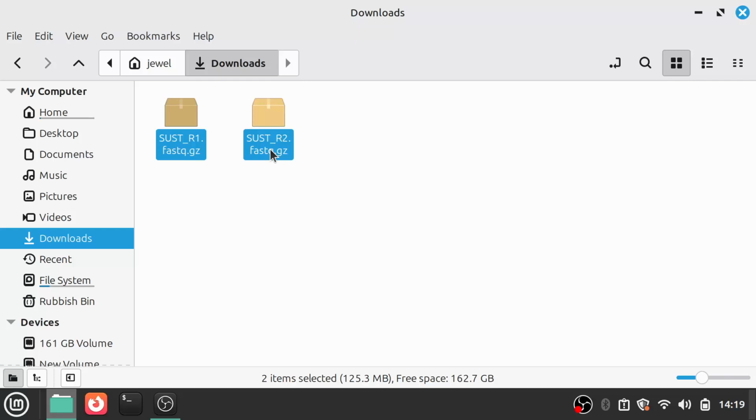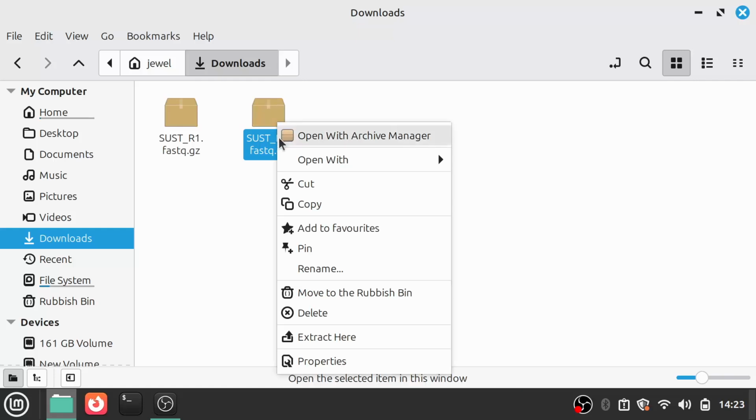These are paired end FASTQ files including read1 or R1 and read2 or R2 file. These files were generated from paired end sequencing and were provided directly by the sequencing service provider after completion of the sequencing run. You can also notice that the files are provided in .fastq.gz format. The .gz indicates that the FASTQ files are compressed to reduce file size and make data transfer easier. We can extract or decompress these files to obtain raw FASTQ files for downstream bioinformatics analysis.